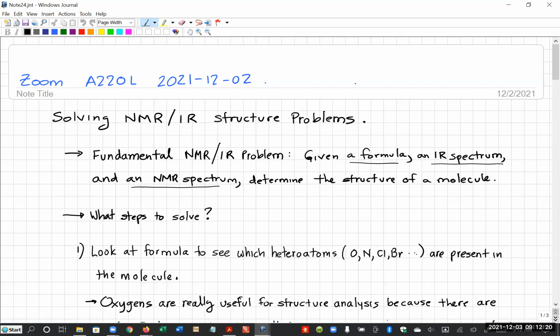So these are the notes from my lecture yesterday, and I'm going to go ahead and just cover these again so that we have them in our thing. They do basically explain what we're doing here. And then I have, as I said, an example problem to work with you guys, which will give you an idea of how this works.